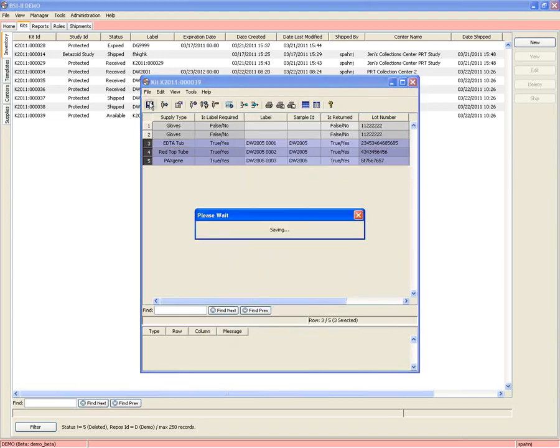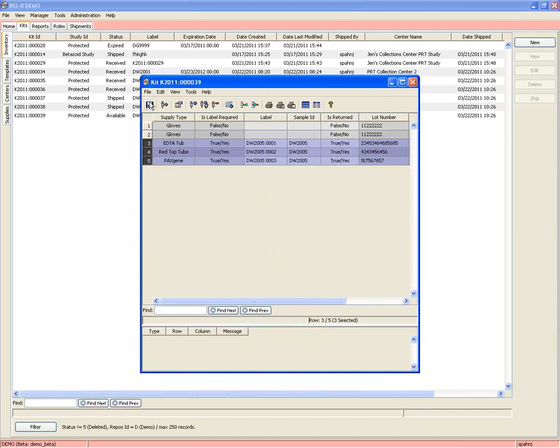And save my kit. And I can keep duplicating and duplicating and duplicating. So right now this is the quick way. Again, this is the first iteration of kits, so depending on user need and user request, we could certainly add another way to quickly generate kits.